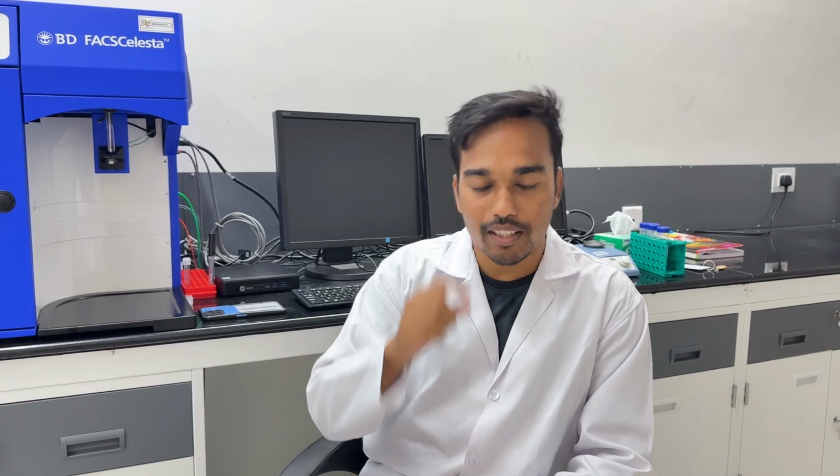Hi, I'm Prem Singh Anand. I'm working in the Immunoengineering Lab, Department of Bioengineering, under Professor Siddharth Jhunjhunwala. I'm working on a disease called colitis, which happens in the intestine of humans. We try to mimic these colitis-like symptoms in mouse models, where we use DSS, which is the compound for inducing this colitis symptom in mice. This causes disruptions in the epithelial layer of the intestine.